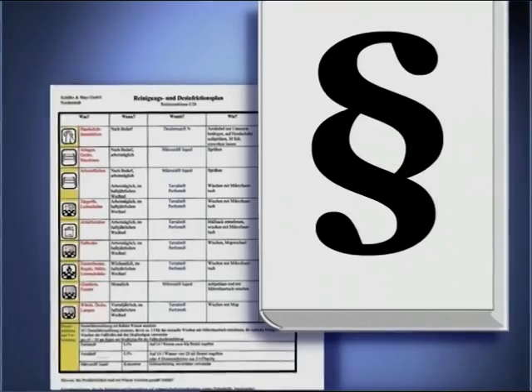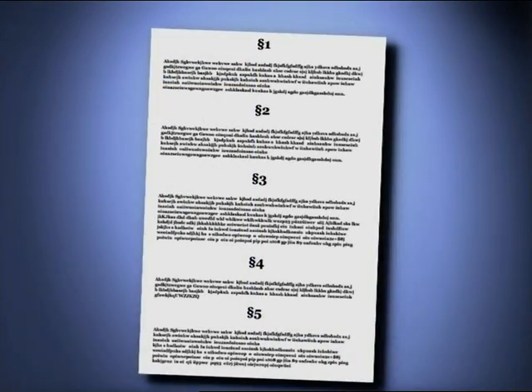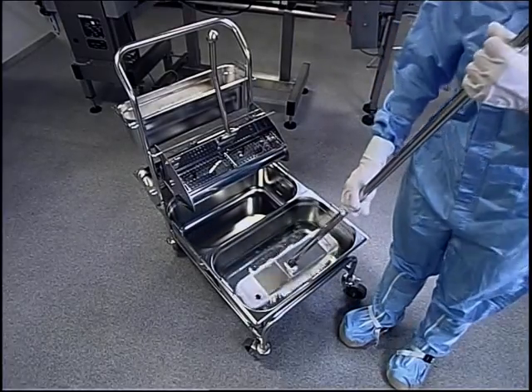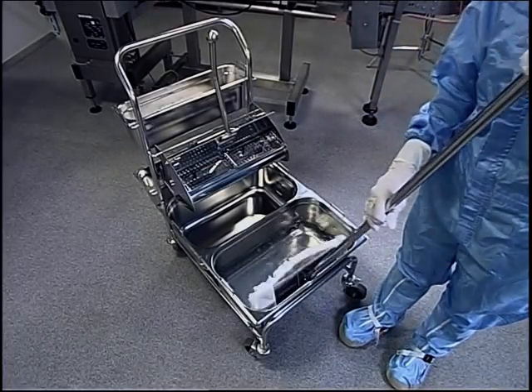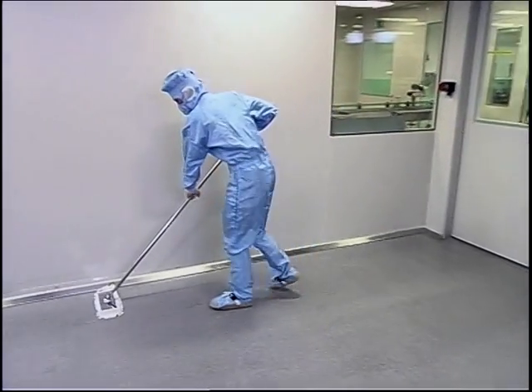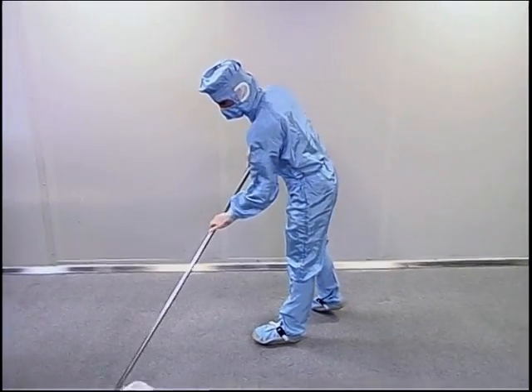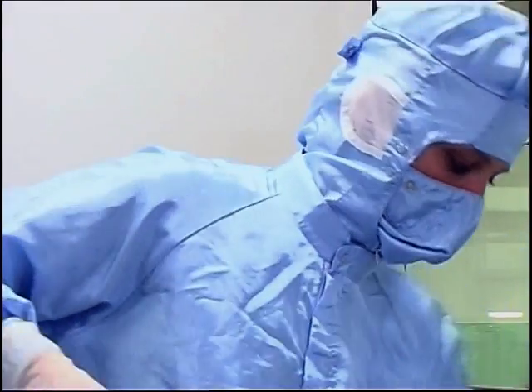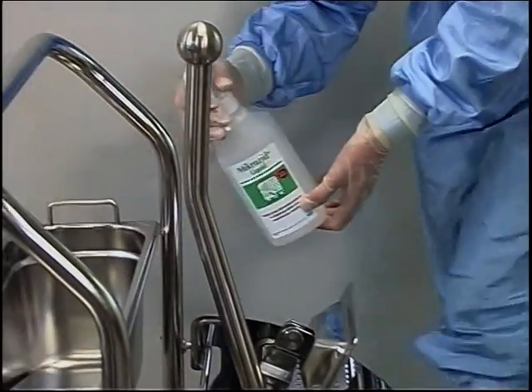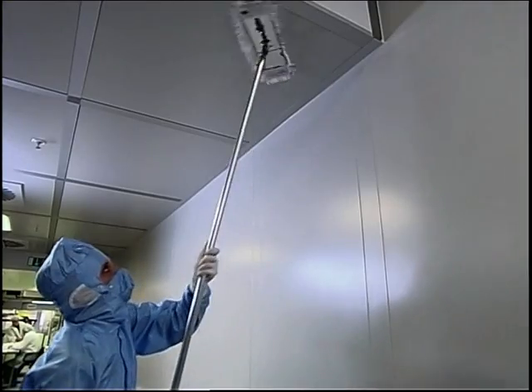For this reason, different cleaning agents and disinfectants must be used for the respective clean rooms. These specifications have been laid down in the relevant GMP guidelines and recommendations, in standards and regulations, and in operational hygiene concepts and standard operating procedures. In summary, it can be said that cleaning hygienically sensitive areas is a very special task which, besides qualified and effective staff, also requires an acute sense of responsibility.